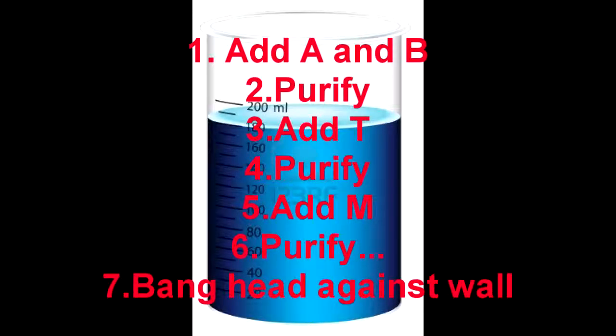Circumventing this issue using a liquid technique would require repeated ligation and purification processes between each addition of an amino acid to the growing peptide chain. If our addition reaction and purification results in lackluster yields at each step, the end result is we will have a low yield for the peptide we are trying to produce.